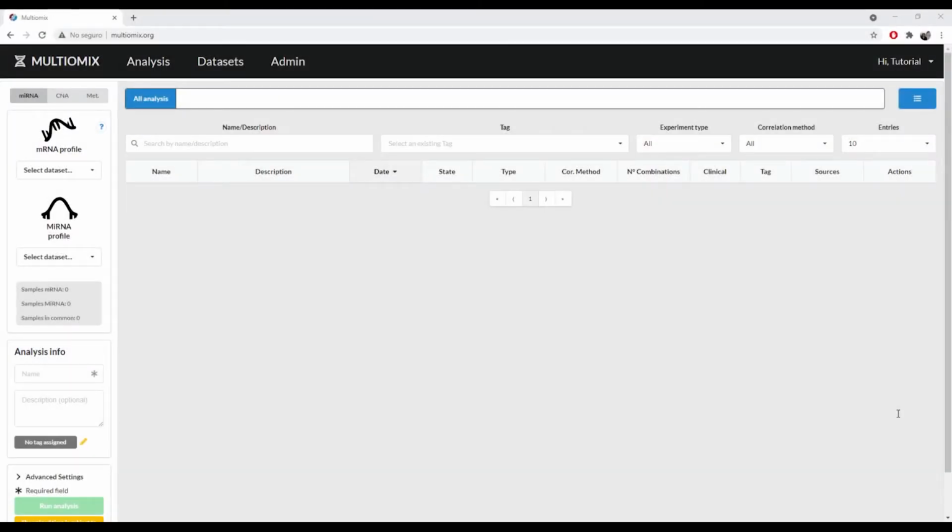Welcome! In this video, we'll be showing you how to upload your datasets to Multiomix and which formats the platform can correctly process. Multiomix allows users to upload their own datasets for different analysis possibilities. Uploaded datasets are stored in the platform for the user's exclusive use.